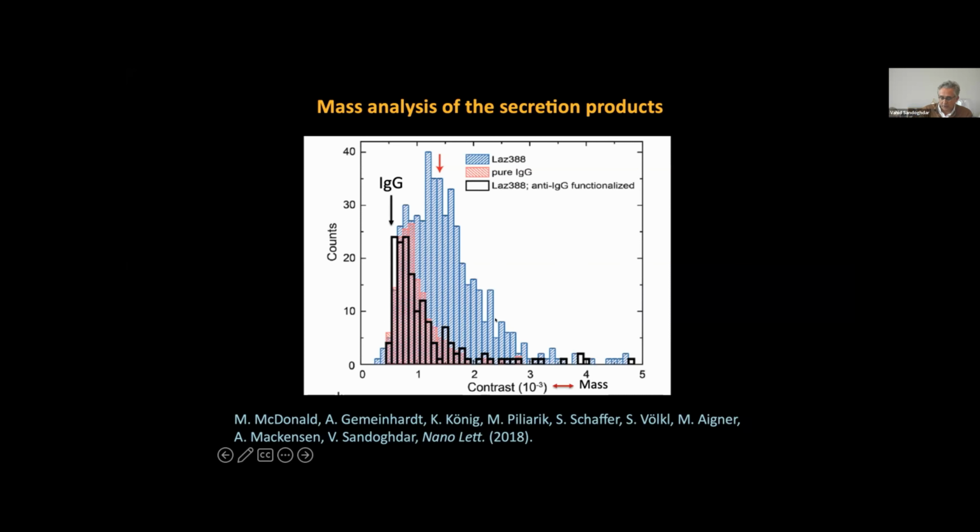Another thing that is fairly new, but goes along the same direction, is the interest in sizing nanoparticles and also establishing their refractive index. This is something that has been available commercially using so-called NTA, nanoparticle tracking analysis. What these commercial devices do is they have a suspension and they illuminate that in a dark field mode and basically track individual nanoparticles in dark field microscopy.